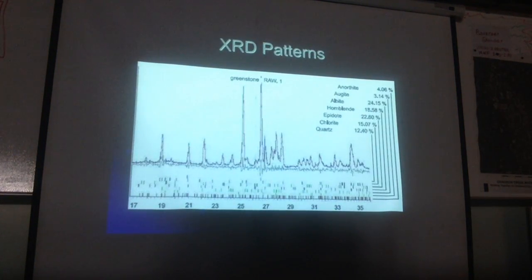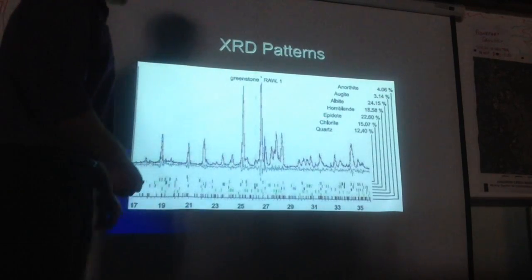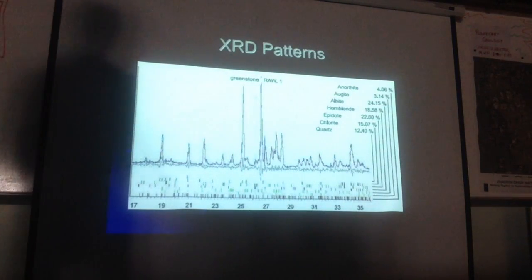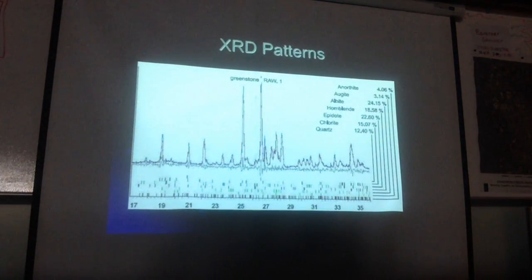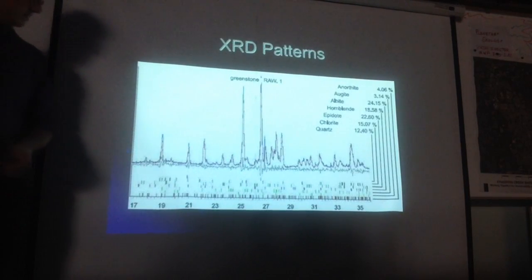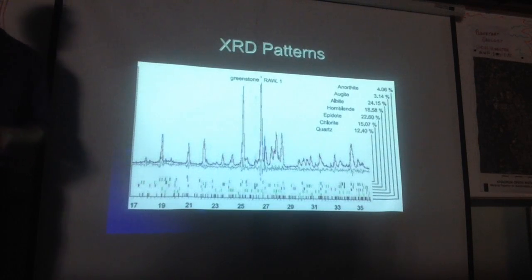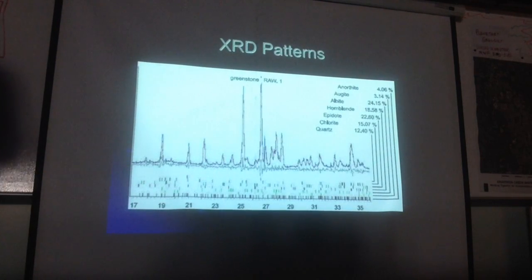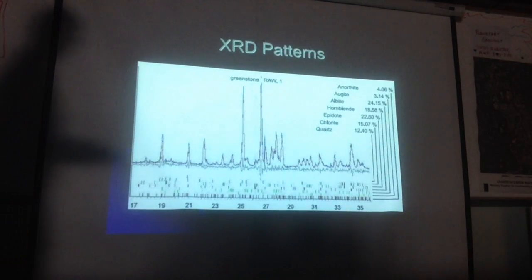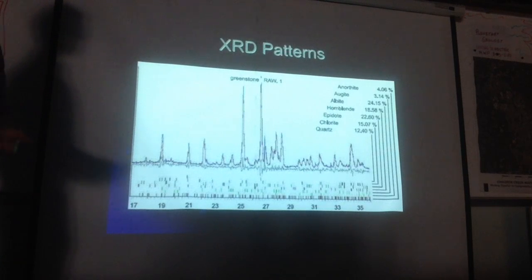So when you run a sample, this is what it looks like. It gives you a readout that's in raw data. So unless you have a program, usually, the program that I've used the most is Jade. That's actually the program that most everyone uses. There's not a really good shareware version, so you have to sort of shell out for the license for it.